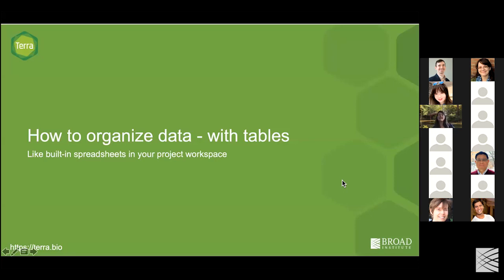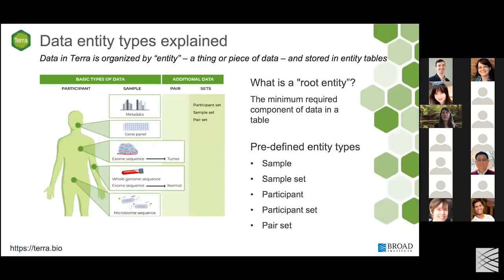Once your data is in Terra, you can organize it with tables. And you can think of data tables like built-in spreadsheets. So they help you keep track of all of those files that are in the cloud environment.